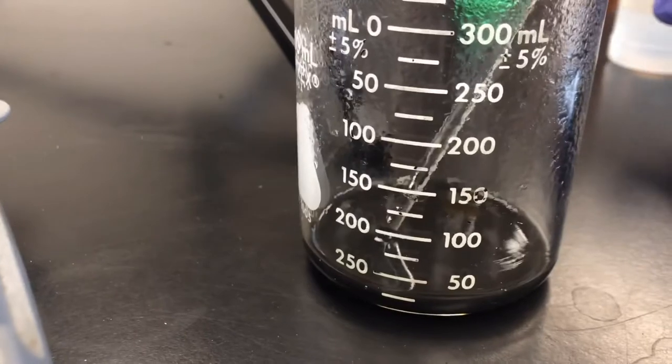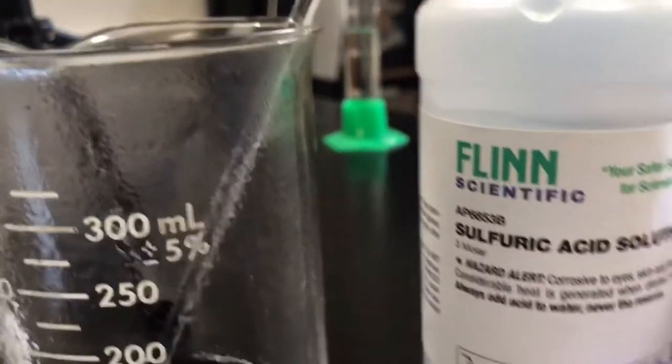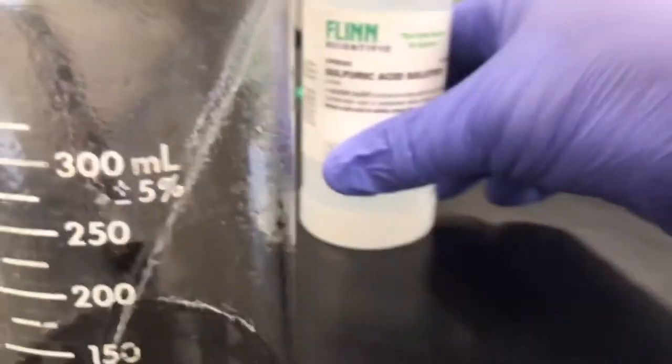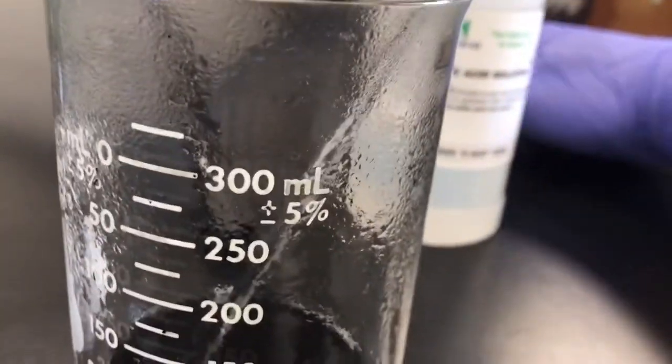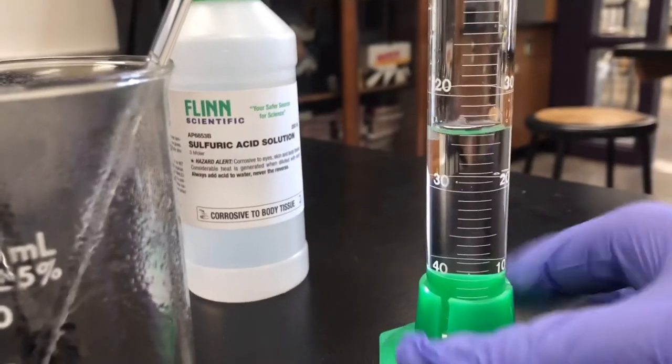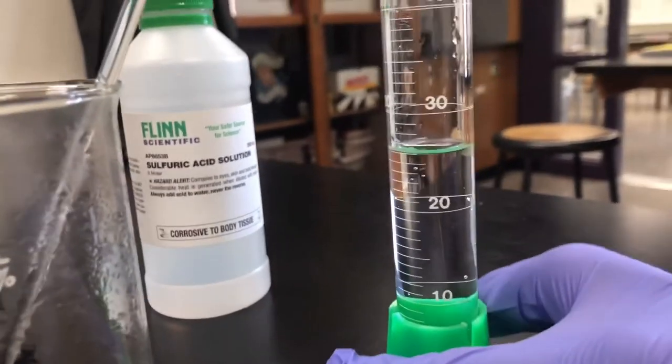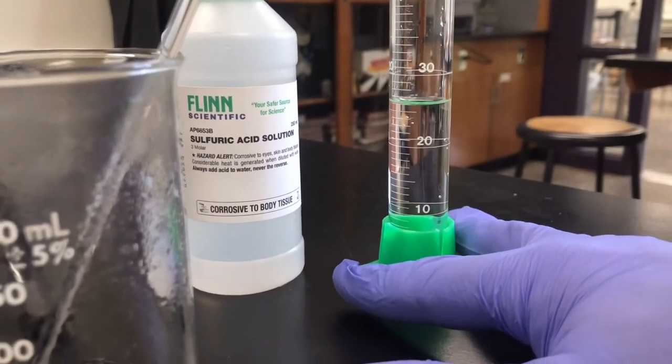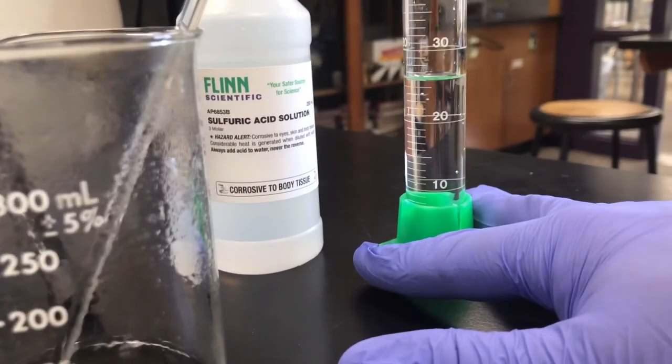So now we are going to put in three molar sulfuric acid, H2SO4. We're going to add this, we got 25 milliliters of this. We're going to add this at about five milliliters at a time. We are not going to add this quickly.